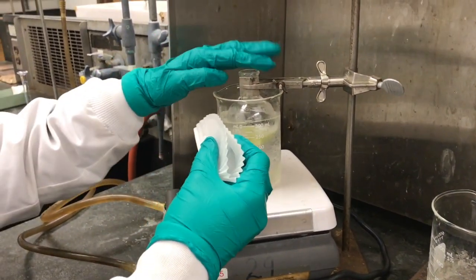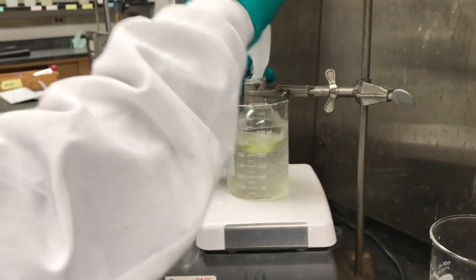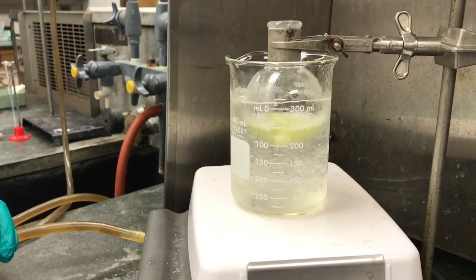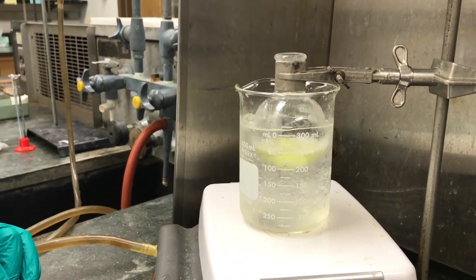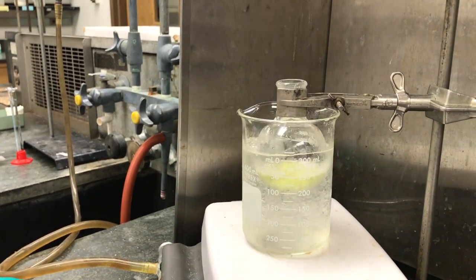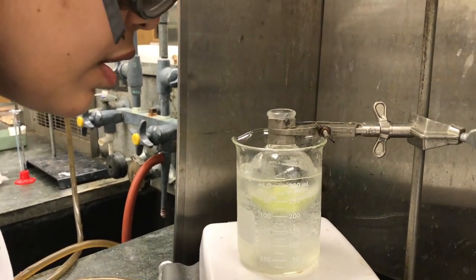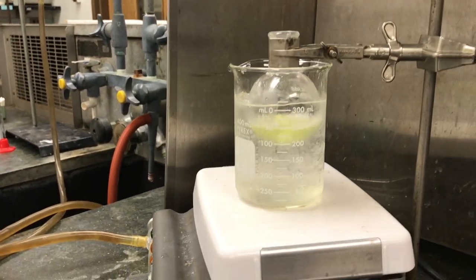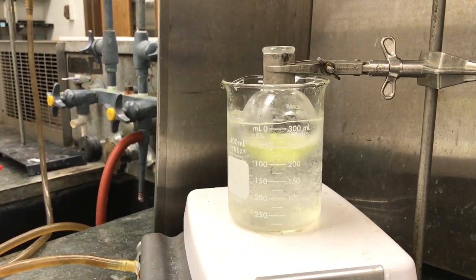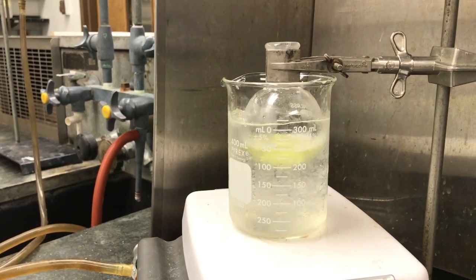Just make note of the color as well, if we didn't mention that before. The color definitely turned a little bit more yellowish, a darker color, after addition of borohydride and after stirring it for 5 minutes. Was there solid? No, it's clear actually. Your manual says that maybe not all of the starting material will dissolve, but here we are seeing that basically everything dissolved.